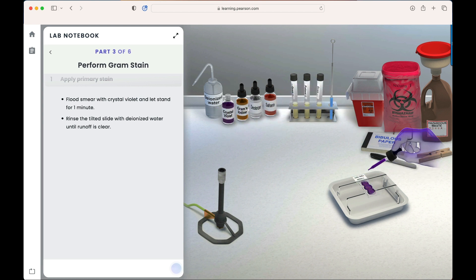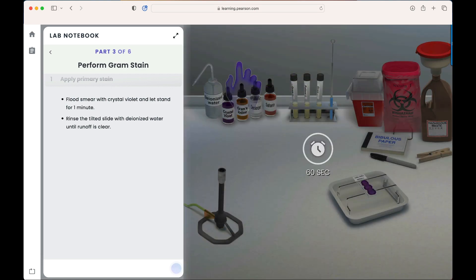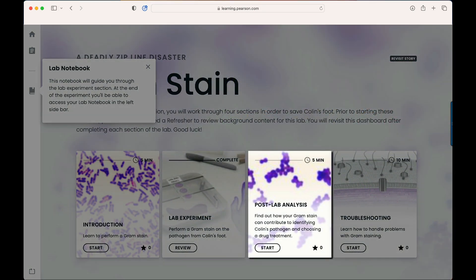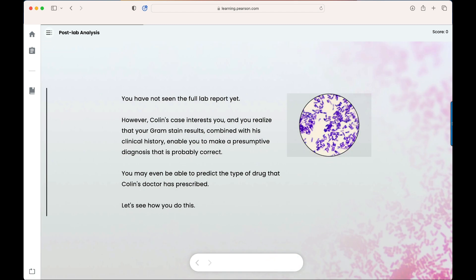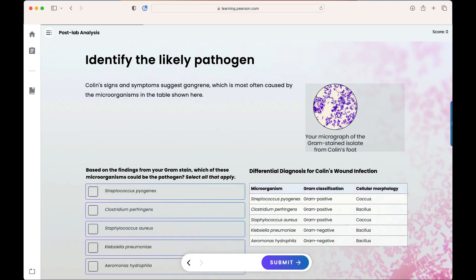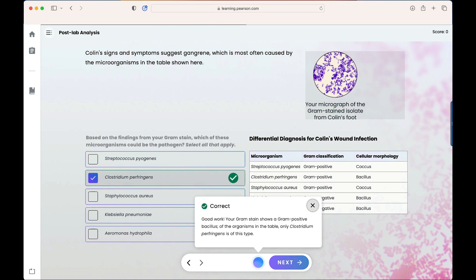Once the lab experiment is complete, we'll return to the dashboard and work through the post-lab analysis. Students will continue to receive information about viable treatment options for Colin, assisting them in understanding suitable drug treatment based on the pathogen. Now we'll return to the dashboard to show the final stage of the lab: troubleshooting.